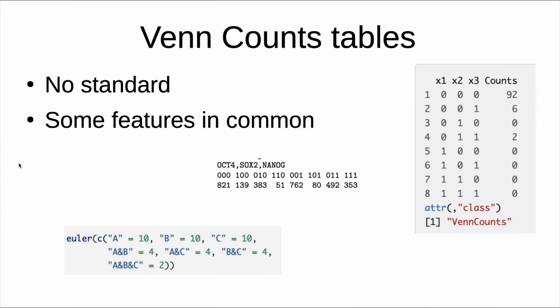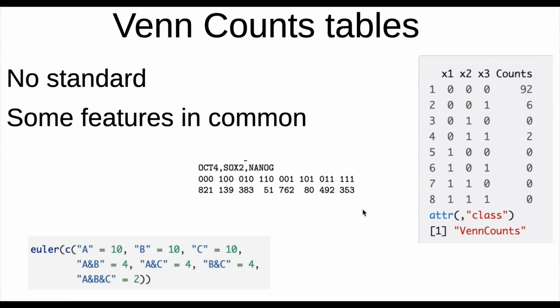What about inputs into other Venns? Unfortunately, there is no standard input for Venn diagrams. This format is accepted by the Vennerable package. It consists of 3 lines: names, then binary combinations. This stands for nothing, this is for the first group, for the second, for the third one, combinations of 1 and 2, 1 and 3, 2 and 3, 1, 2, 3.